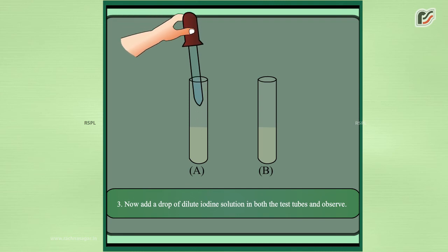3. Now add a drop of dilute iodine solution in both the test tubes and observe.